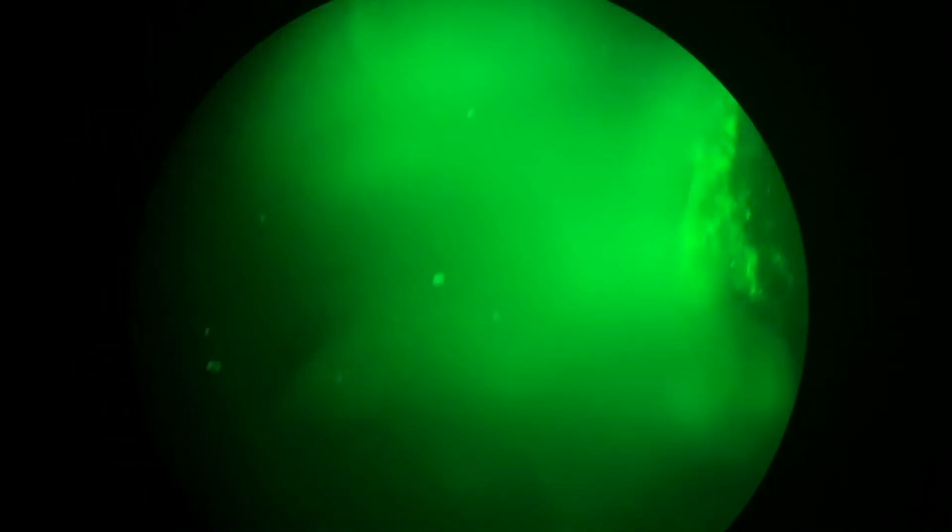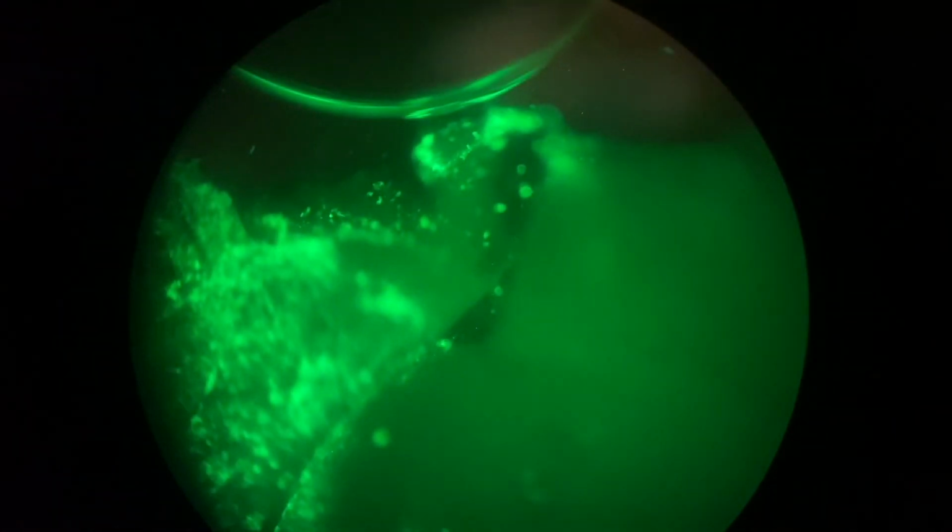Ah, hubris, the villain to progress. These slices did not turn out as expected. Something happened, and I don't know what, but the majority of them didn't take up any of the dye. Like the fluorescence is there, I can see the green, but it's not in any distinguishable shapes, meaning it didn't diffuse into the membranes, except for this good old slice second from the left.